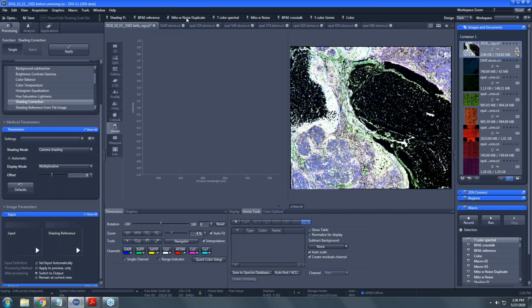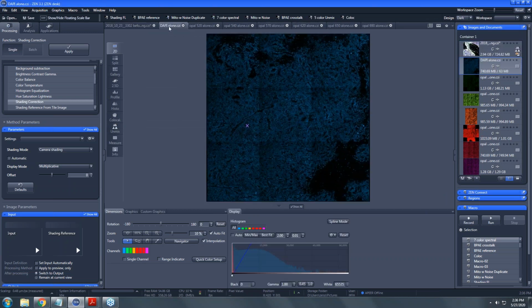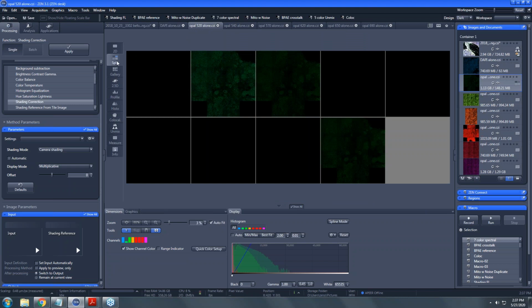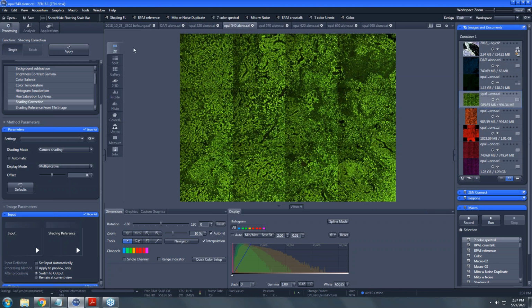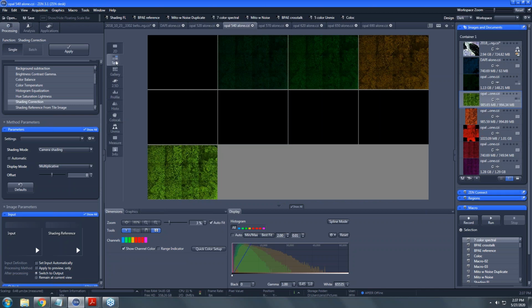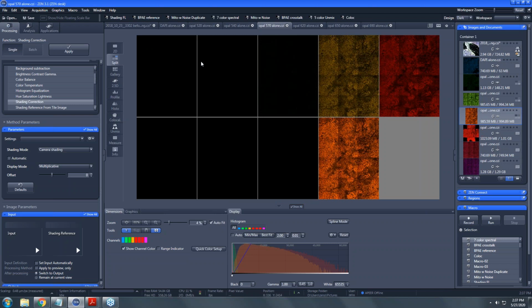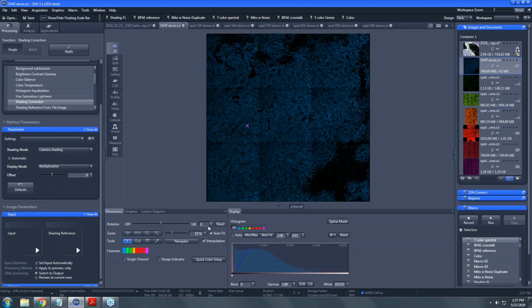If we open up any one of those, we can take a look at a split view of it and see that intensity is largely in a single channel in most of them. Some of them, we have some crosstalk. So that's the GFP. This is the 540. So we're going to have some unwanted intensity in 2 channels there. So on any one of these, well, in fact, all of these, we want to go to the Unmixing tab.